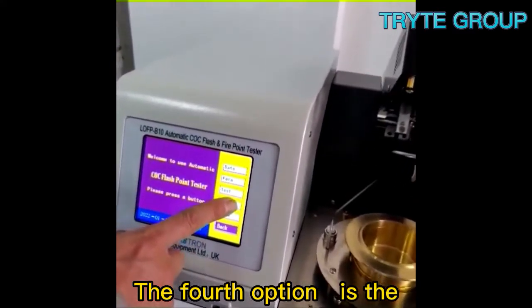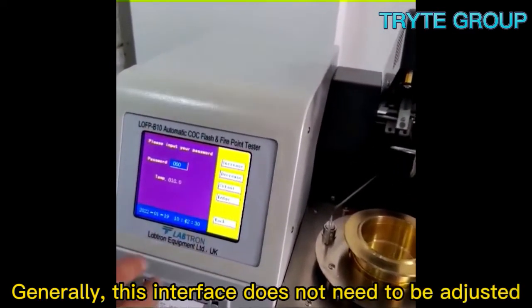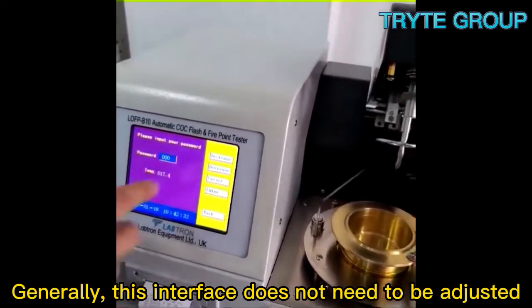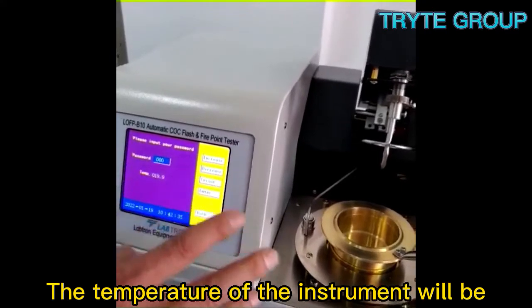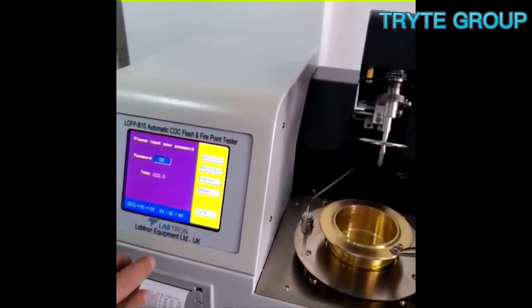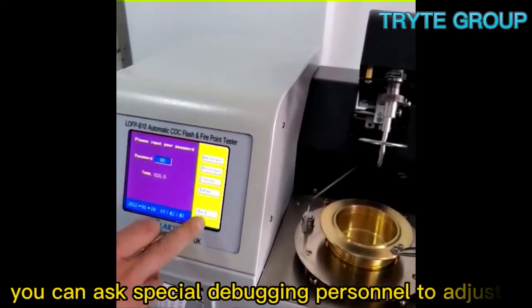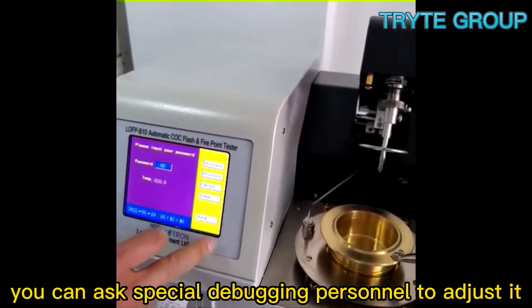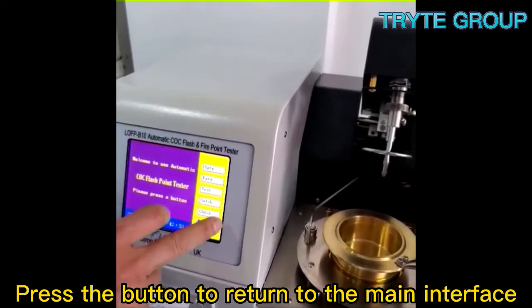The fourth option is the temperature calibration interface. Generally, this interface does not need to be adjusted. The temperature of the instrument will be calibrated before leaving the factory. If temporary calibration is required, you can ask special debugging personnel to adjust it. Press the button to return to the main interface.